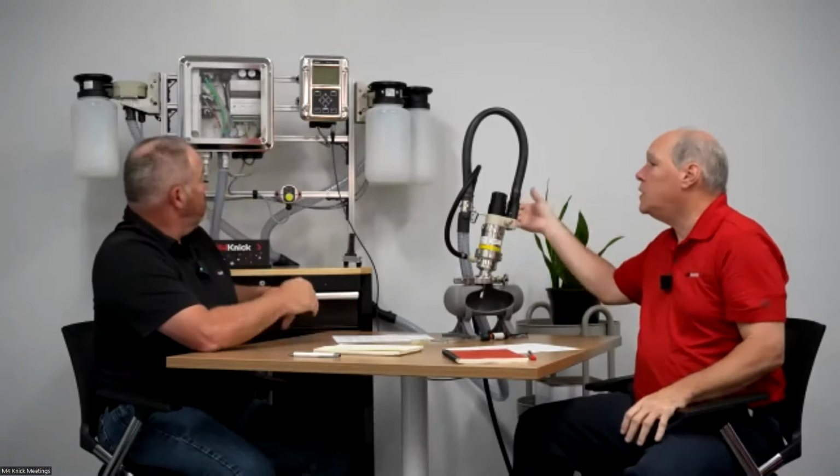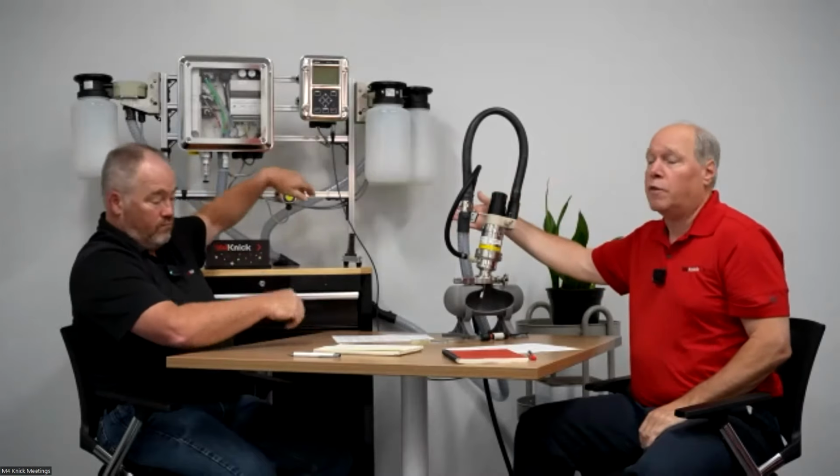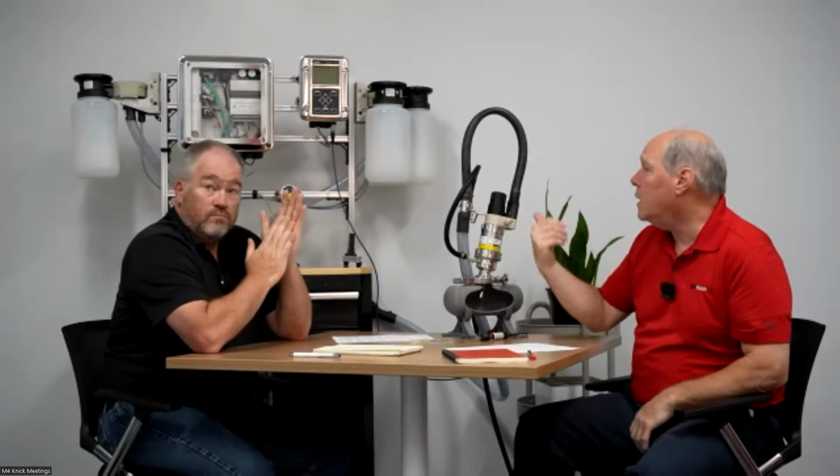And then one thing we didn't really touch on is the service switch is a bypass. So you can put the system in service, and it'll halt any program at that point, and then the operator can do a manual check, let's say, of the probe if he'd like to, a variety of reasons that you would want to get into the service mode and then get back into the process. It's a manual override. Yeah, absolutely.